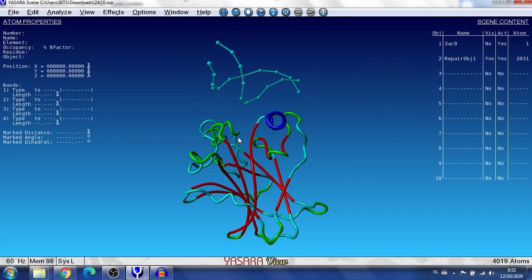And the amino acid we would like to mutate is alanine 159. The important thing is that we identify where this is. So I will first open this repair object and do some very short visualizations.